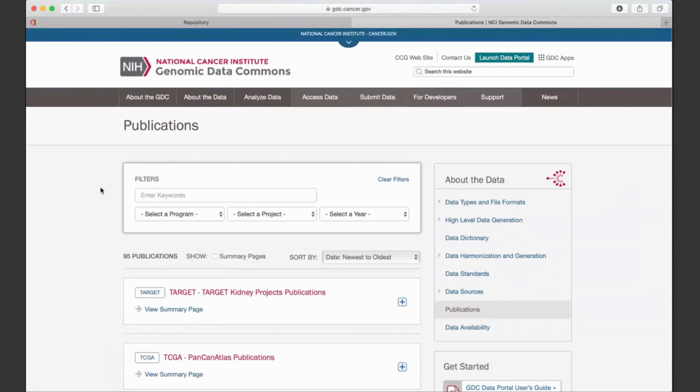It's not only for the DNA-Seq variants, which is relatively easier. We can just make changes in the last step of annotation and in the MAF, but bearing in mind that RNA-Seq alignment itself actually takes the gene model into consideration.